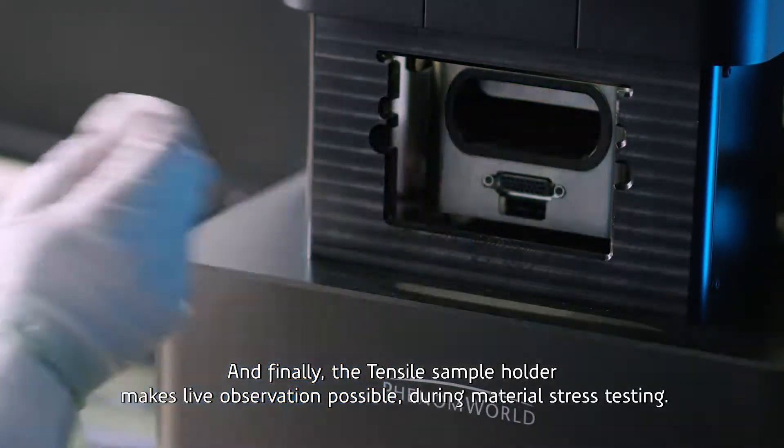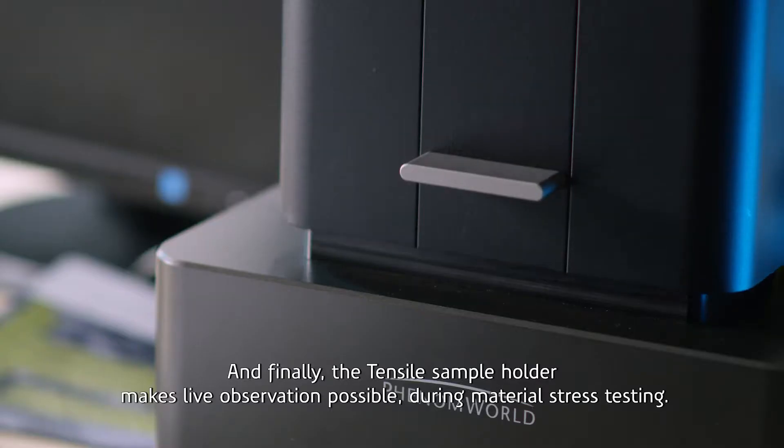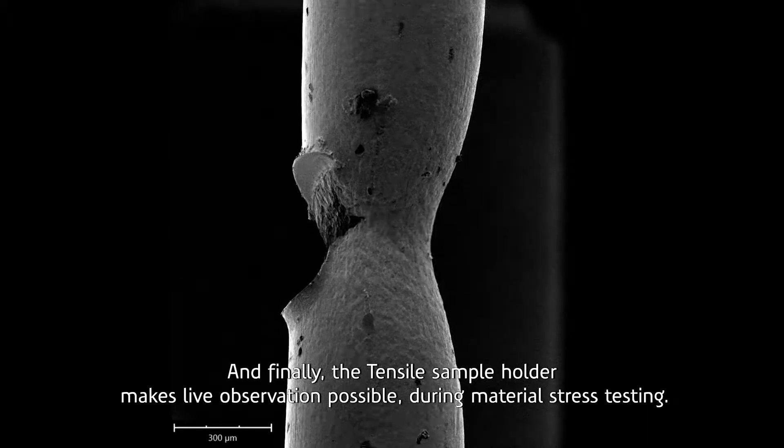And finally, the Tensile sample holder makes live observation possible during material stress testing.